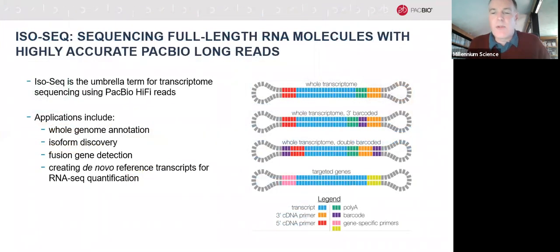And then for those of you that were on the calls before, you'll recognize the topology of these SMRTbell molecules. So you're able to take your full-length cDNA and bind on these SMRTbell adapters to make these circular molecules. And of course, you've got some options of exactly which way you do this. You can either grab the cDNA and put on the standard SMRTbell adapters and sequence away.